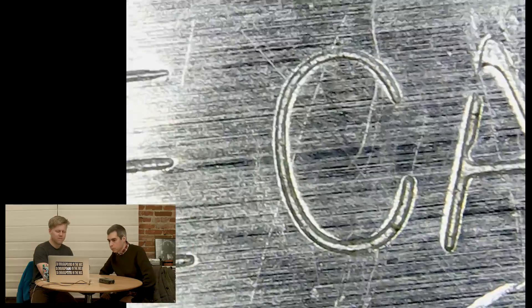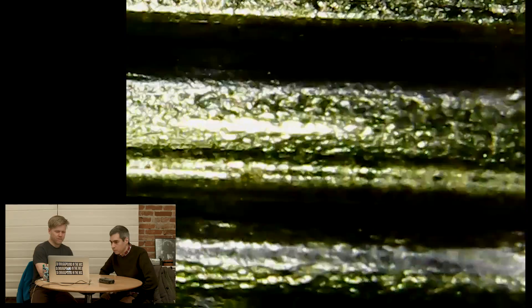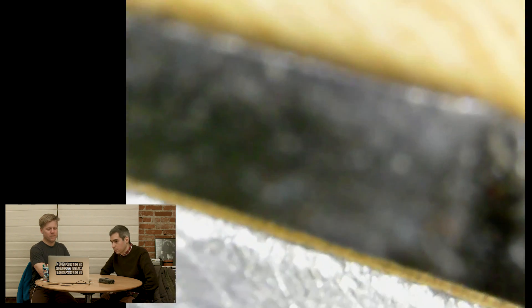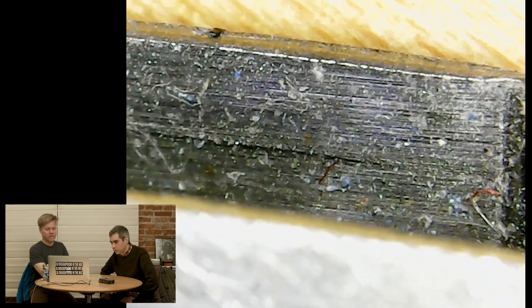All right, so let's start off with this razor blade. It says "Wesley Snipes" — A.K.A. "Use Caution" right here. It's kind of too big to look at, some of these parts of it, but let's just look at the sharpness of the blade. Here we go. Look at how cut up and scratched up the cover is. Just like everything else in my house, it's incredibly dusty. Look at that. So that's the blade coming out.